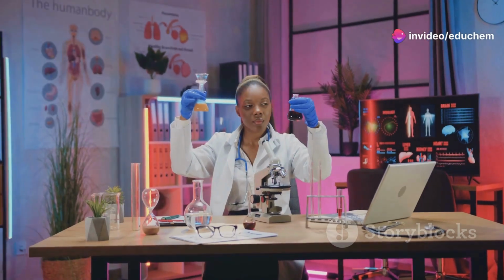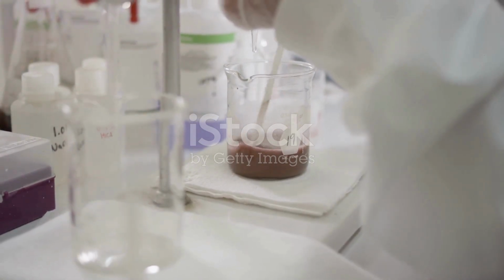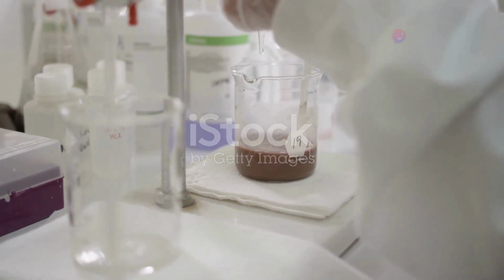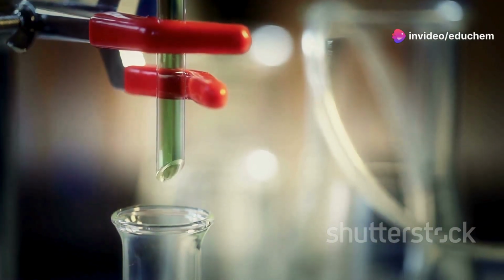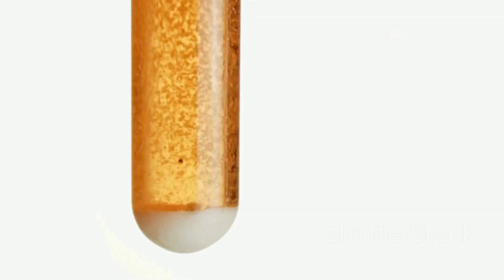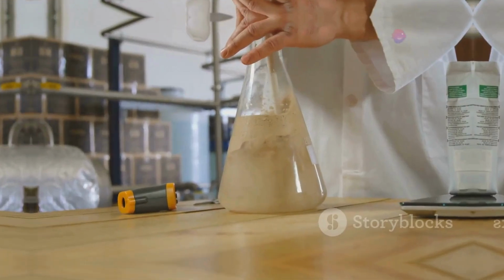Today we're going to explore how to prepare salts using various methods. Salts are essential compounds in chemistry, and there are several ways to prepare them depending on the reactants and conditions. In this video we'll cover the preparation of salts by ionic precipitation, titration, direct combination, and reactions involving acids with metals, insoluble bases, and insoluble carbonates. Let's dive in.